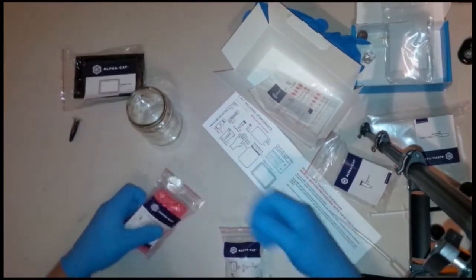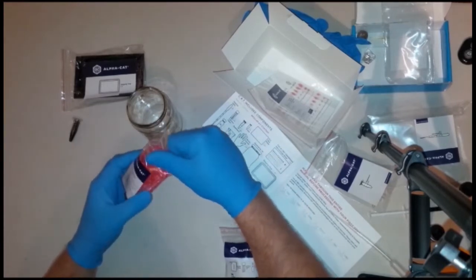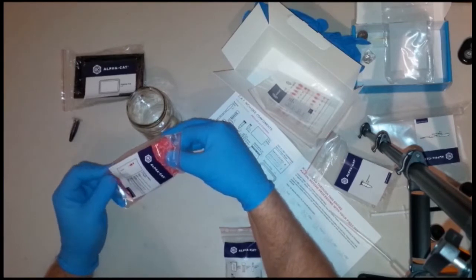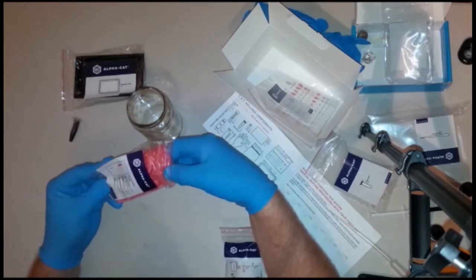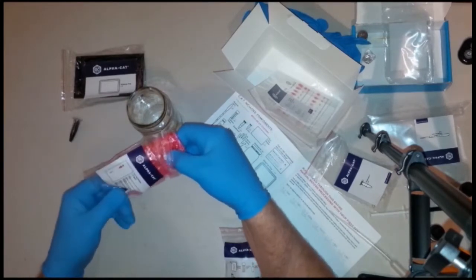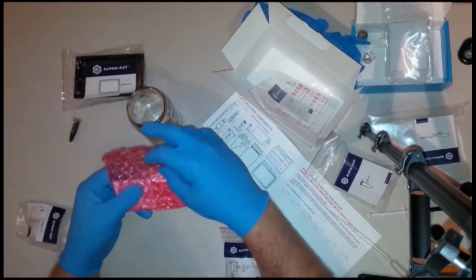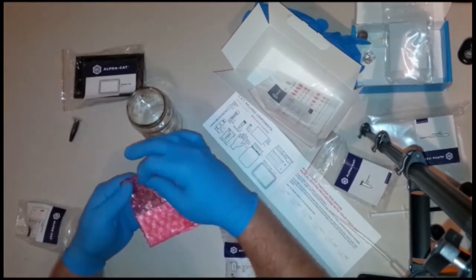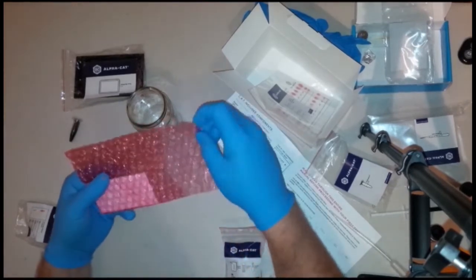The next stage is to remove one of the test plates. It is important to be careful with these and treat them with care. In this video, we are only testing the one sample, but we will test it 3 times to make sure we have consistent results. To extract exactly 1 microliter, we use one of the 10 supplied capillary tubes, which is placed in a special holder. When the capillary is full to the top, we then release it on the spot on the testing plate. If you are going to test different samples, ensure you change the capillary tubes for each one.